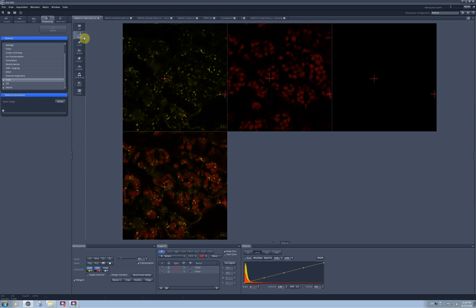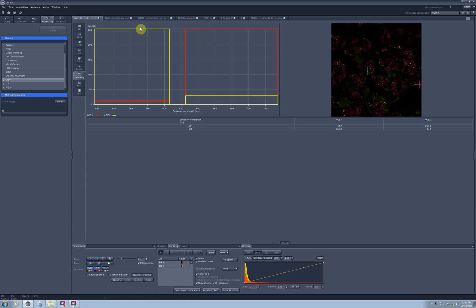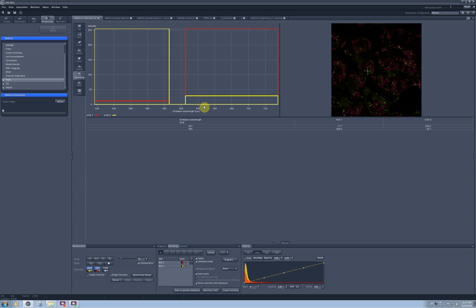Unmixing here was done on a simple multi-channel image and this is obviously not an optimal way to unmix images because this is quite a crude estimation.